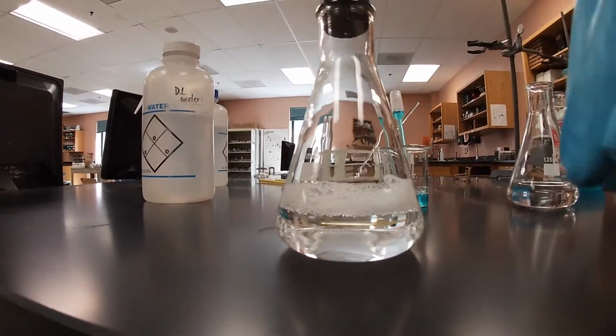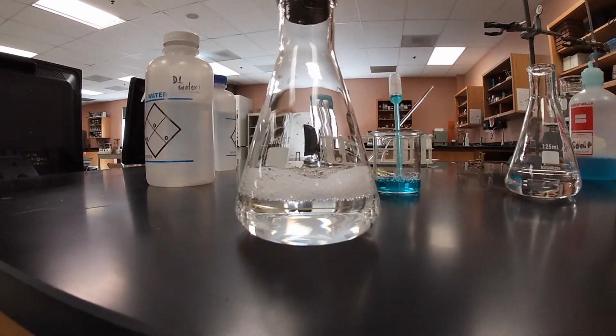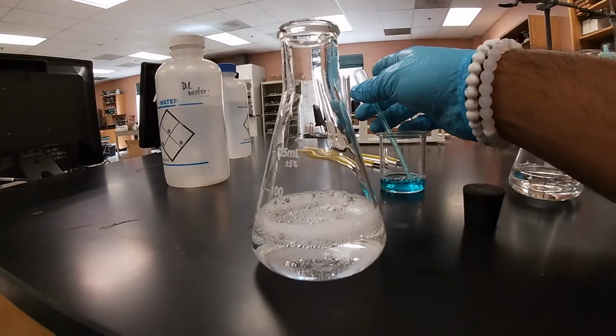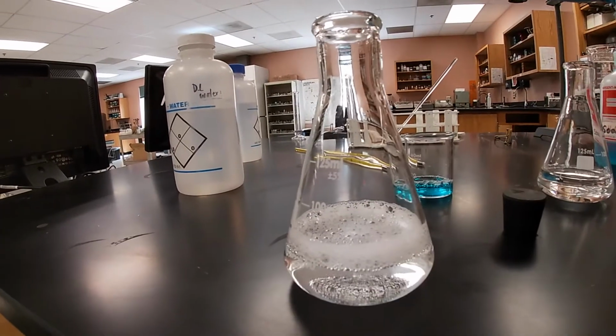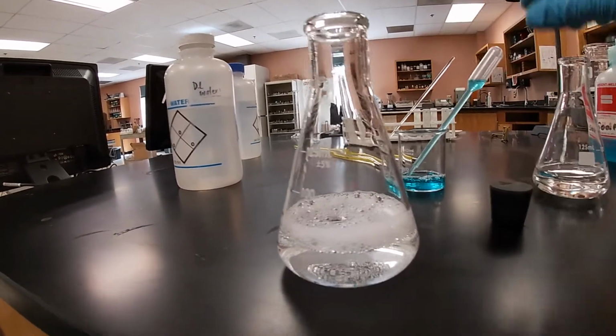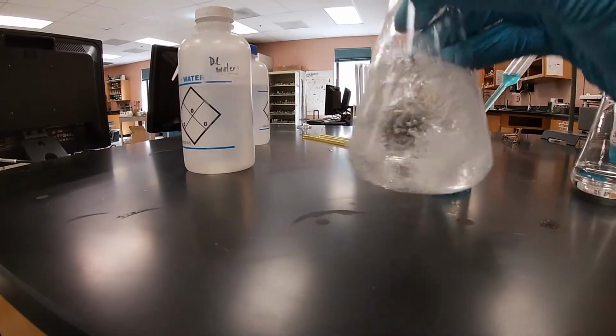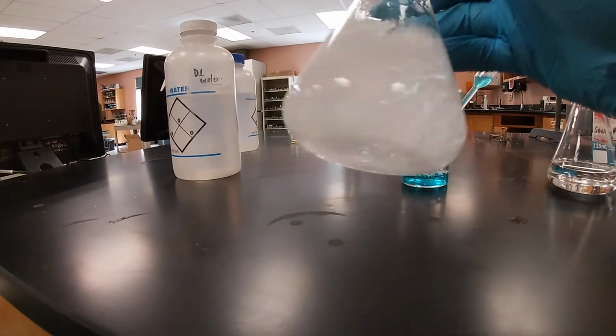And as we wait for that suds layer, we're going to work on our tap water. We'll add another drop just in case, right? And so we added another drop of the soap, and here we're going to cap it again and then shake for 10 seconds.